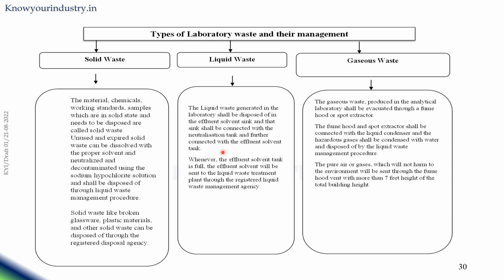Now coming to the liquid waste. The liquid waste generated in the laboratory shall be disposed of in an effluent solvent sink, and that sink shall be connected with the neutralization tank and further connected with the effluent solvent tank. Whenever the effluent solvent tank is full, the effluent solvent will be sent to the liquid waste treatment plant through the registered liquid waste management agency.